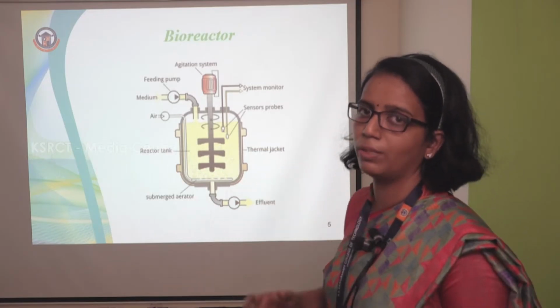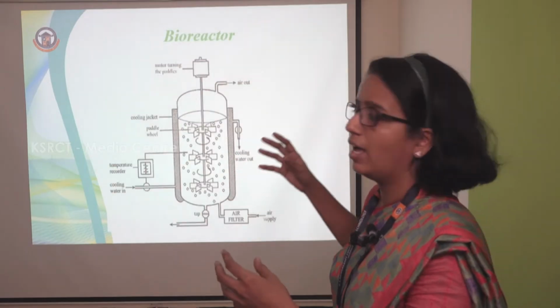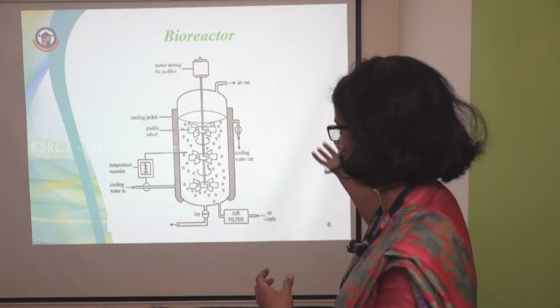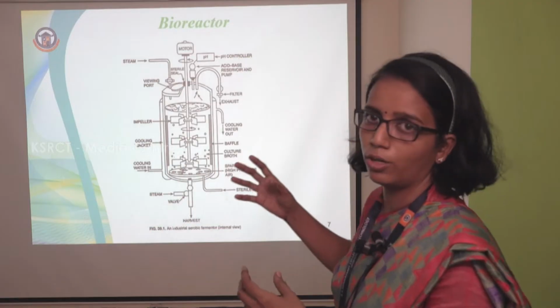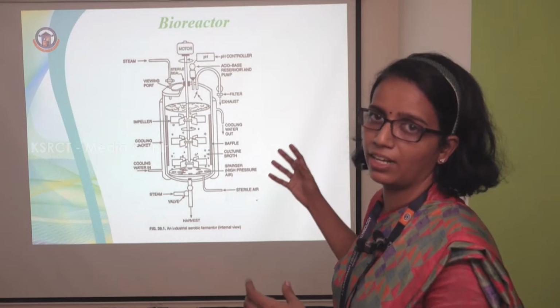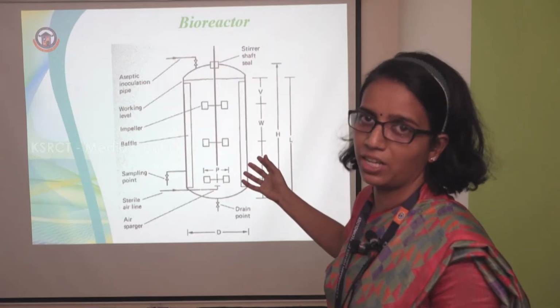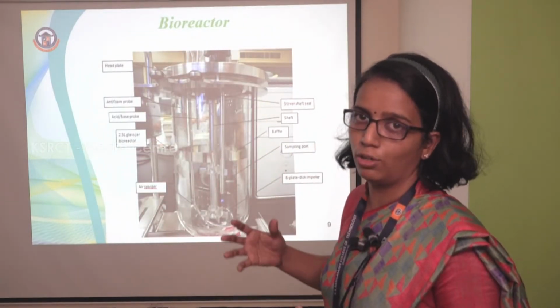These are some of the designs that I would like to project for the bioreactor design. This is one simple design, followed by multiple designs with additional ports available in a bioreactor, facilitating various applications like temperature control and pH control. And this is one complicated reactor, designed with a number of water cooling systems and a pH control system, acid port, sampling port, everything in this particular equipped bioreactor. Next is a simple reactor design which we can use for examination purposes. And here is the live model of how the reactor will look exactly.